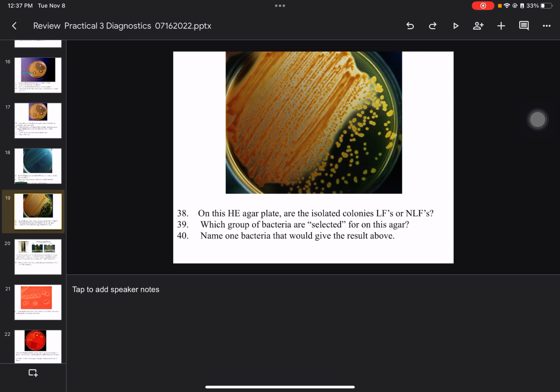All right, this is a fermenter. This is Hektoen. This is a fermenter. But what is the application for Hektoen? What do we use it for? What's its application? Testing of poop. Yeah. So if you have a lactose fermenter in poop, we don't care. It's normal. Okay? When we streak poop, we want to see a bunch of this. That means you're okay. If we see lactose non-fermenters or lactose non-fermenters that are H2S positive, then we worry.